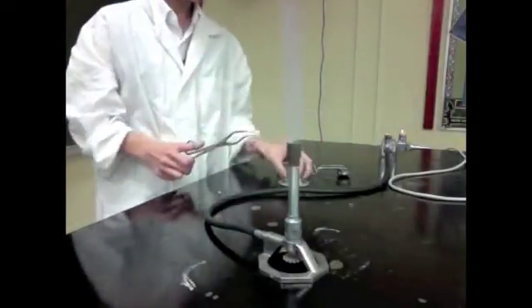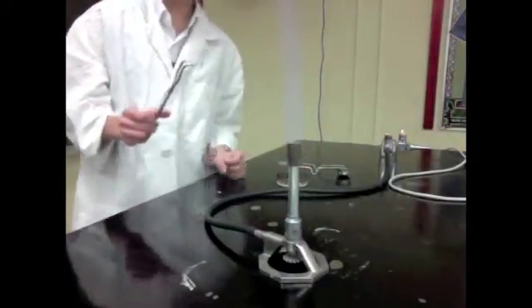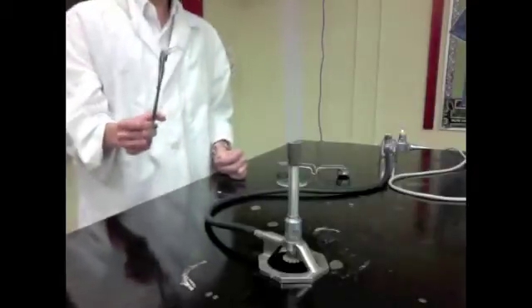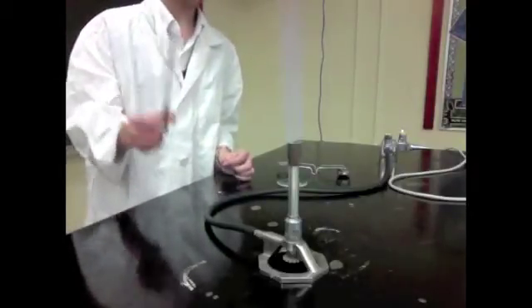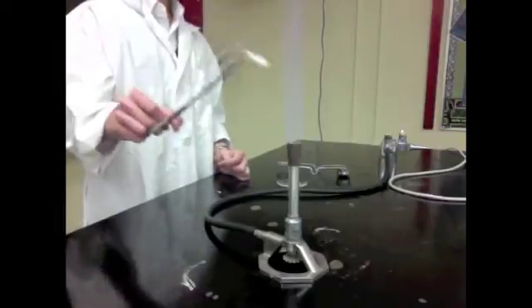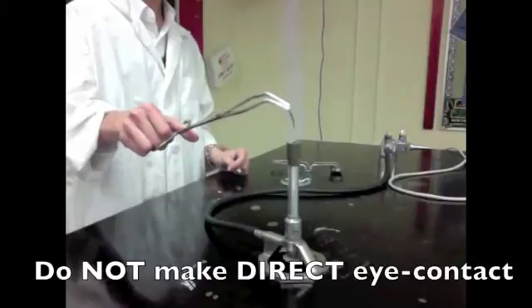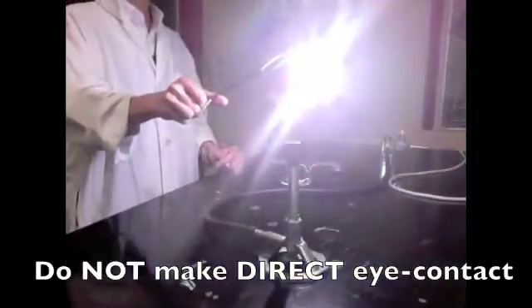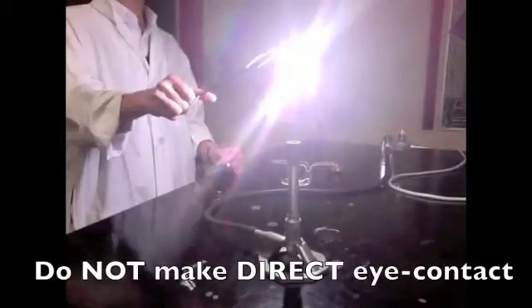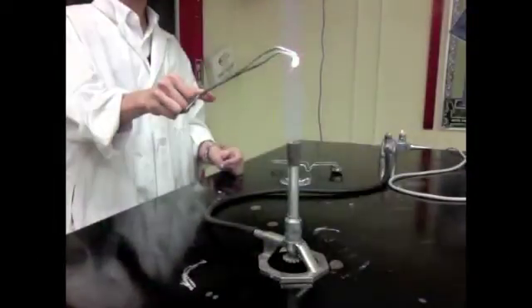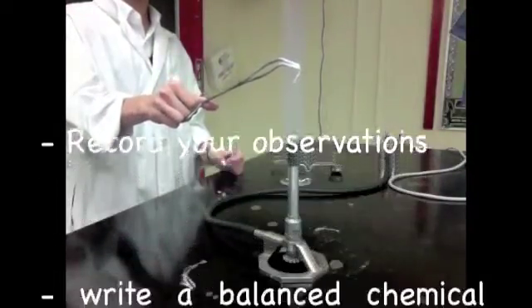So here's the magnesium ribbon. It looks like this, it's just a piece of ribbon. We're going to pick it up with our tongs and we're going to put it over the hottest part of the flame. Be careful not to stare at it too intensely because this may hurt your eyes. So here goes. And record the reaction in your lab reports.